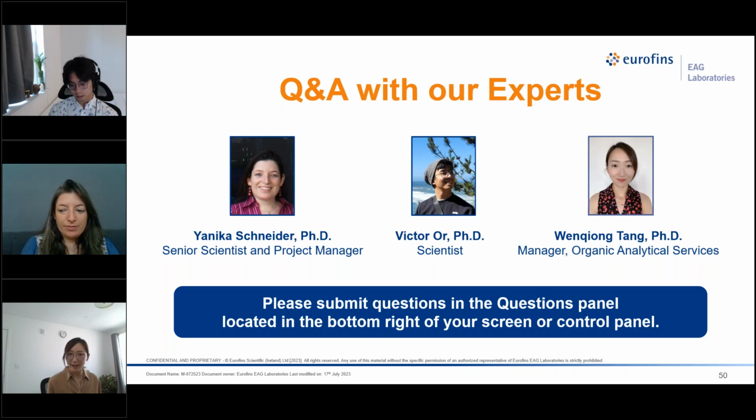I would say yes, both the spectrum and the appearance in the camera. For FTIR, we have never seen a sample get destroyed by exposure to infrared light because it's a very mild, low power source. When it comes to Raman analysis, depending on the laser, because the laser does have much higher energy, there is a chance you may burn your sample if you use too high of a power level.